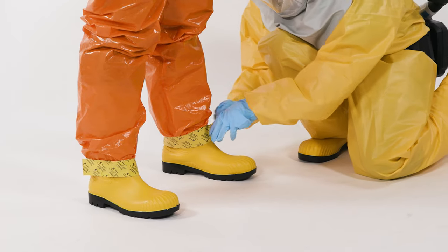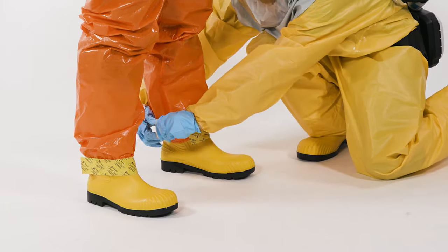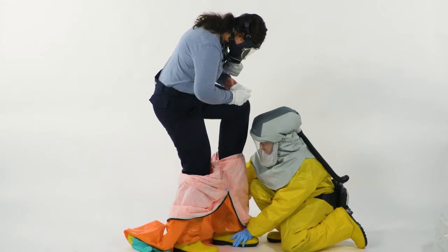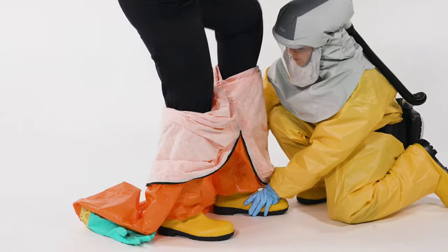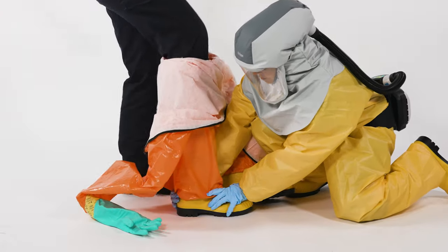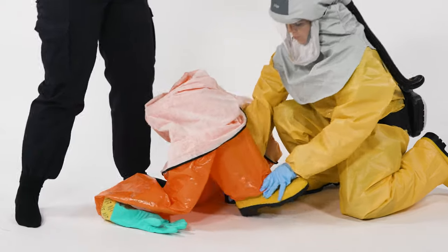Have the tape between the boots and the suit removed. Take off your boots and put them aside. Then doff the suit completely. Again, make sure to touch the contaminated side only with protective clothing.